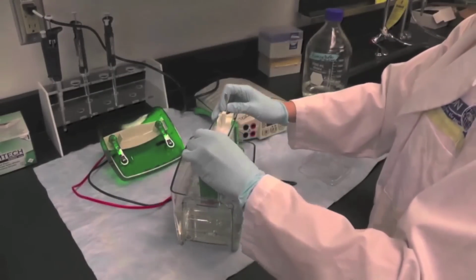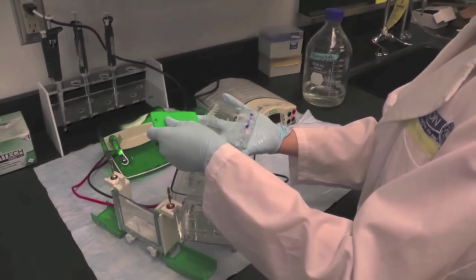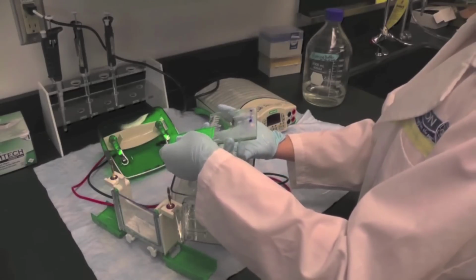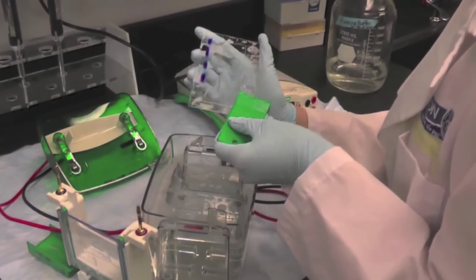Unplug the power supply, then remove the running module from the tank and drain the running buffer. Remove the glass plates carefully from the running module, then carefully use the gel releaser to remove the gel from the glass plates. You can trim off the stacking gel carefully before proceeding to staining.